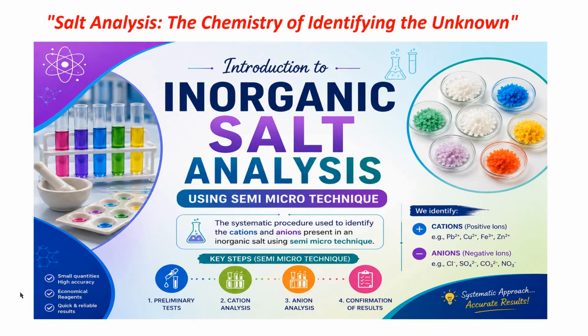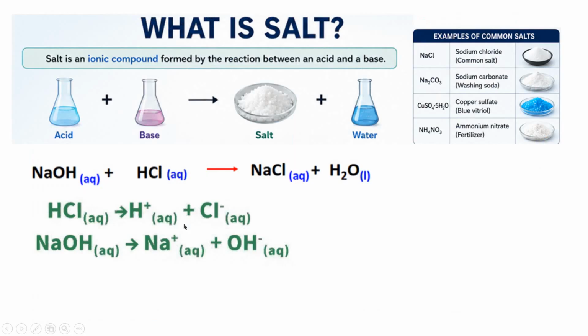Salt analysis, the chemistry of identifying the unknown. A series of videos will come in this course on the systematic analysis of the salt by semi-micro technique. This is the introductory video where I'll give you the content of this course. So let's start the video.